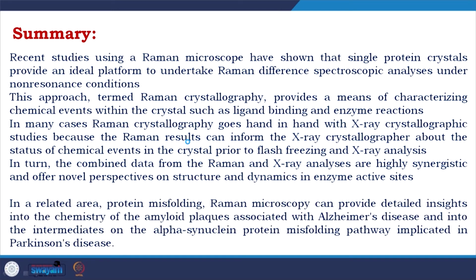In a related area, protein misfolding, Raman microscopy, which I did not explain much, can provide detailed insights into the chemistry of the amyloid plaques associated with Alzheimer's disease and into the intermediates of the alpha synuclein protein misfolding pathway implicated in Parkinson's disease.